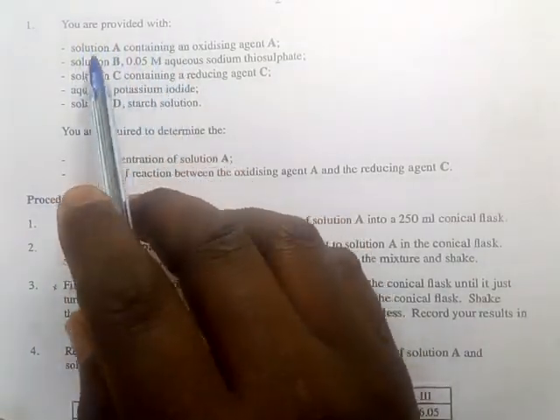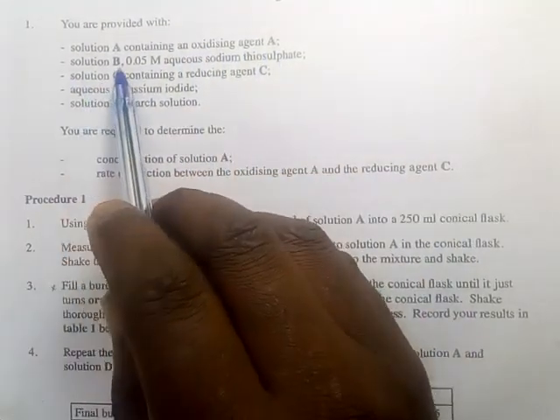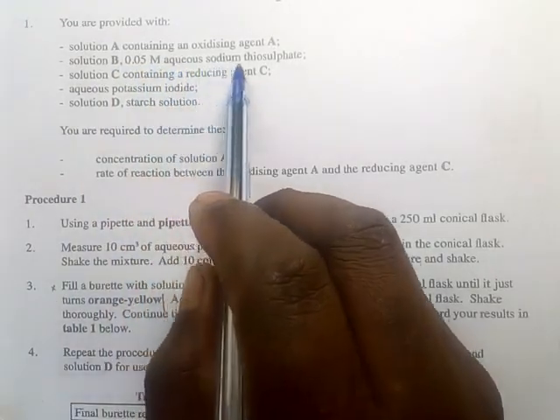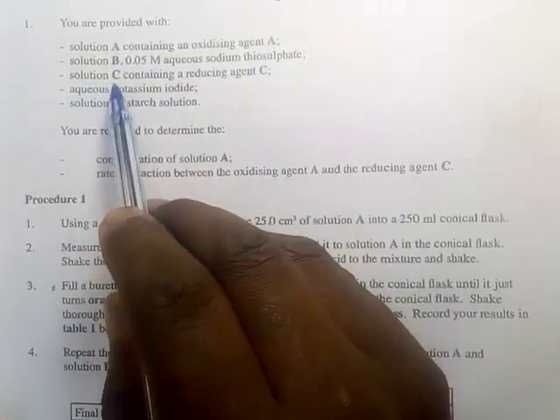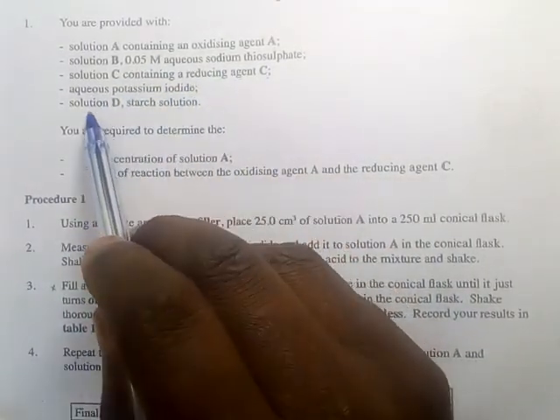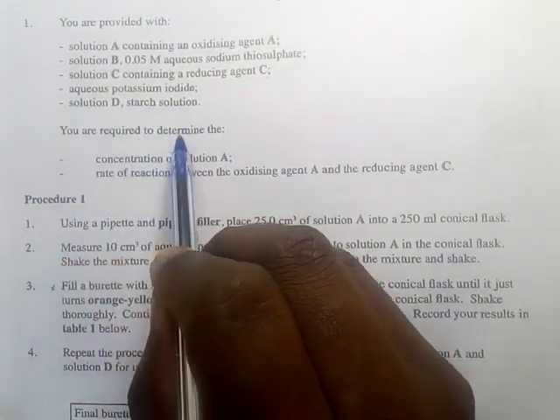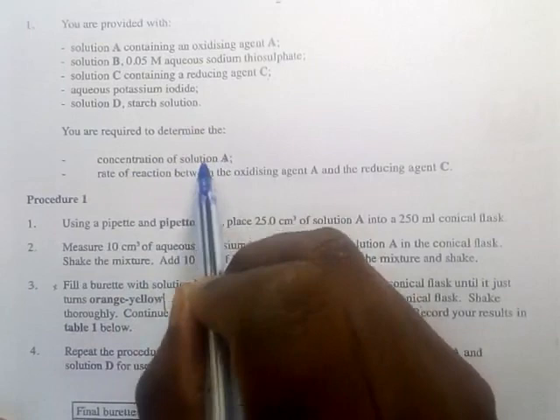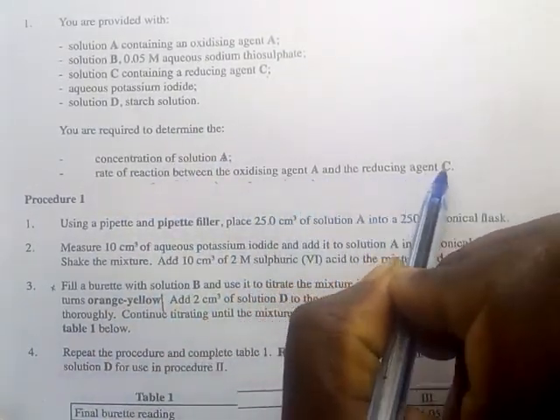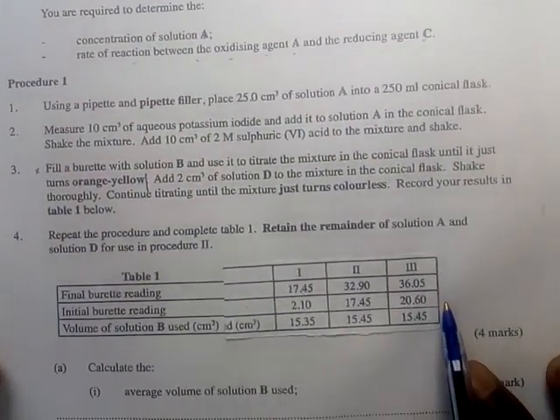You are provided with solution A containing an oxidizing agent A, solution B containing 0.05 molar aqueous sodium thiosulfate, solution C containing a reducing agent C, aqueous potassium iodide, and solution D, starch solution. You are required to determine the concentration of solution A and the rate of reaction between the oxidizing agent A and the reducing agent C. So procedure 1, the titration part of it.